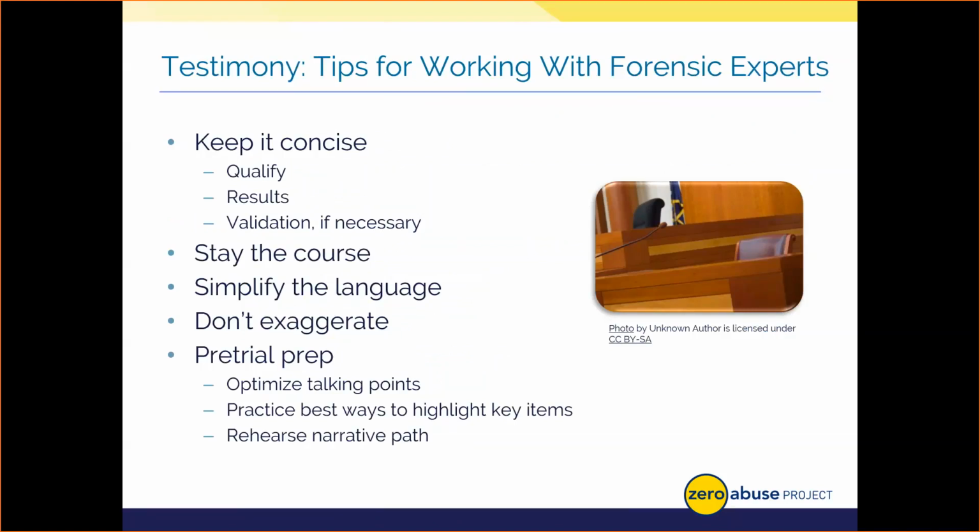Keep it concise, qualify the individual, get their information out there, what proficiency tests they've done, the validity of their background. Keep it to the results, use those analogies that I used, and keep it simple, about an 8th to 12th grade educational level. Talk about validation if you need to. Pare down that language. Don't over exaggerate or overstep.